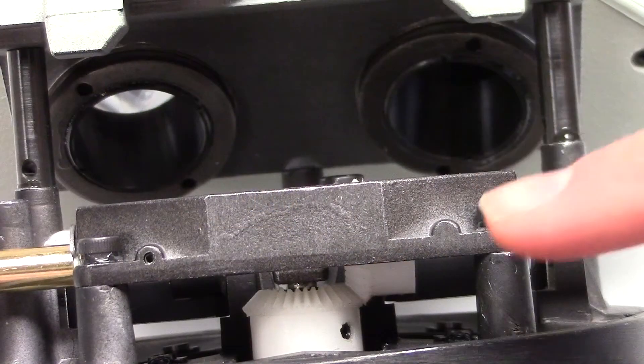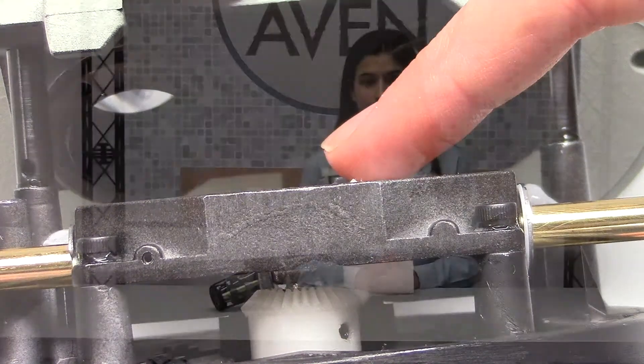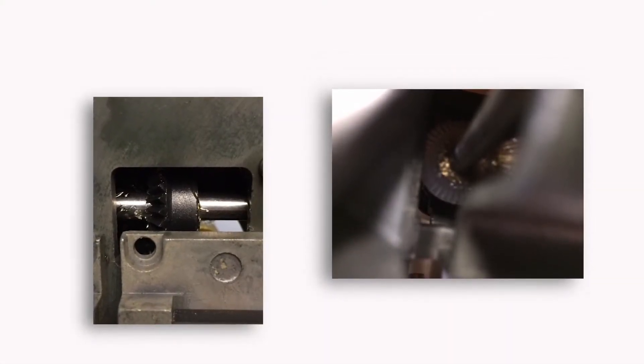The material and manufacturing of the internal gears play a significant role in the quality and longevity of a microscope. Aven Carton brand scopes use quality nylon gears manufactured to the highest precision available, so they are virtually greaseless. Cut-rate scopes use lower grade materials such as plastics and initially require excessive amounts of grease for smooth movements. As the lubricant degrades, slippage occurs causing misalignment.